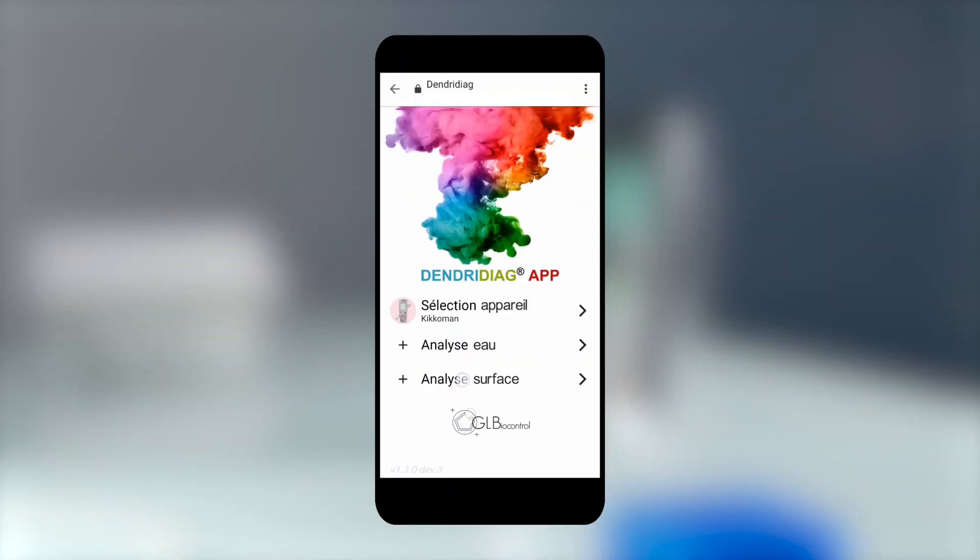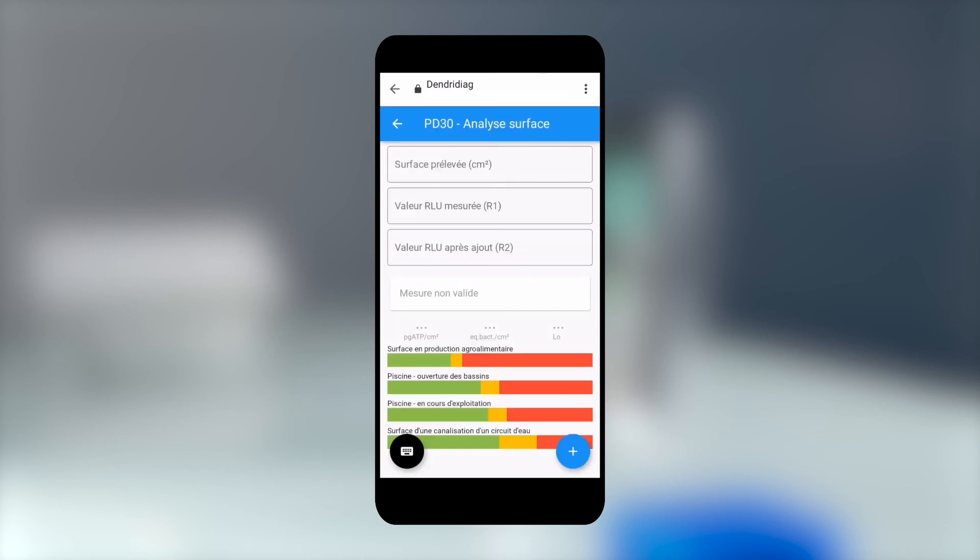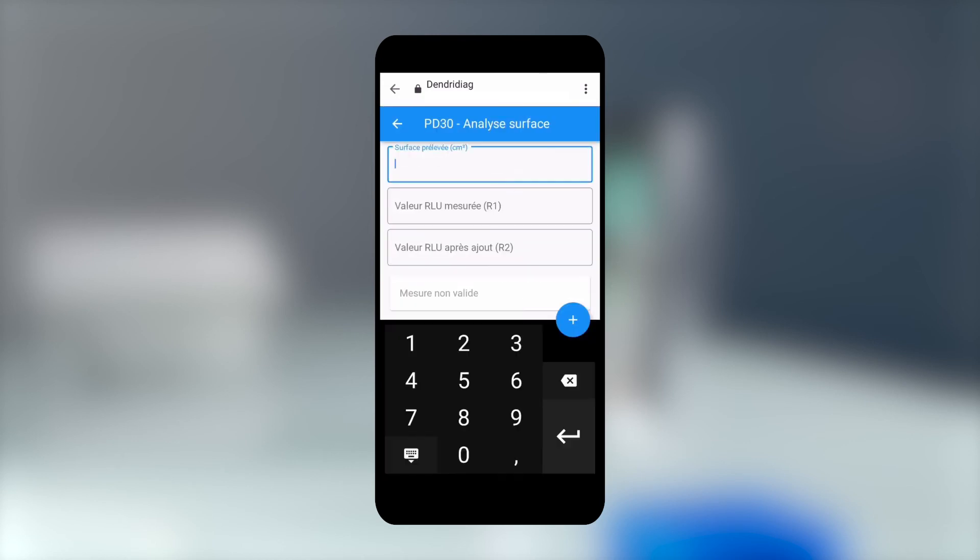An app helps you to interpret your results directly. Enter the surface size and the two results obtained.